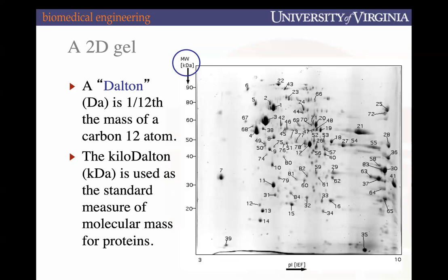Yes. So what about the dots that are lighter at the top? Are you talking about towards the bottom here, or over here where there's dots that don't have a number on them? Oh yeah, that's likely a protein at low concentration, or a low amount of protein there.